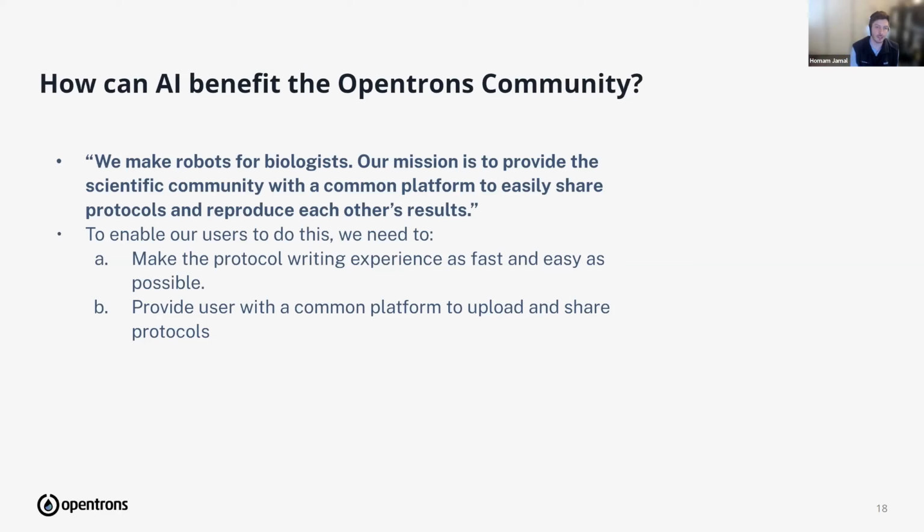We are actively working on our community, the users, being able to upload protocols into a common library. And so expect to see that in the near future as well. And if it's as easy as babysitting a chatbot, as opposed to sitting there and writing a protocol in Python or using a GUI, then we're in a pretty good spot when it comes to expanding the amount of protocols in our protocol library.